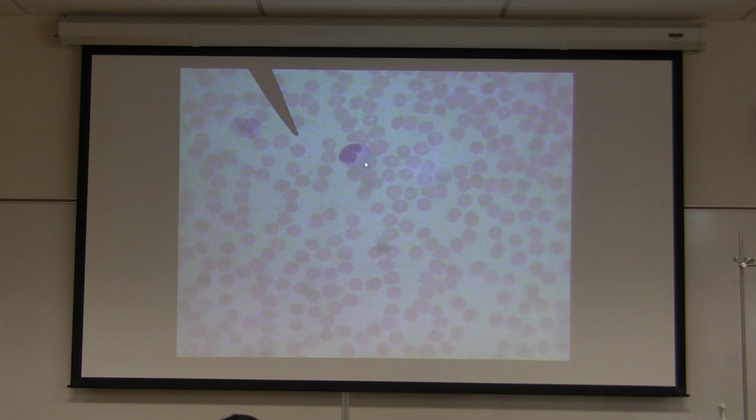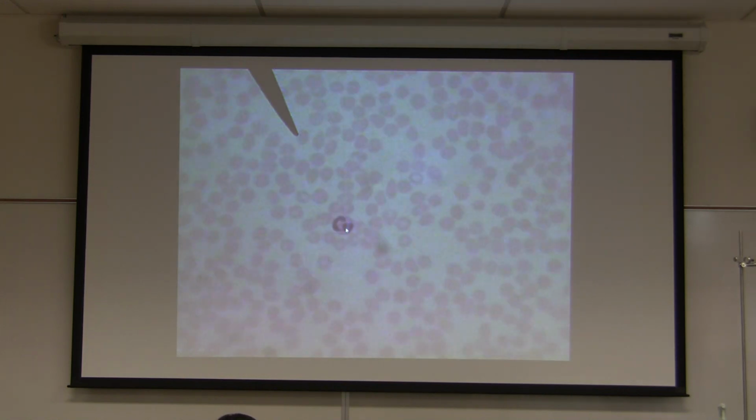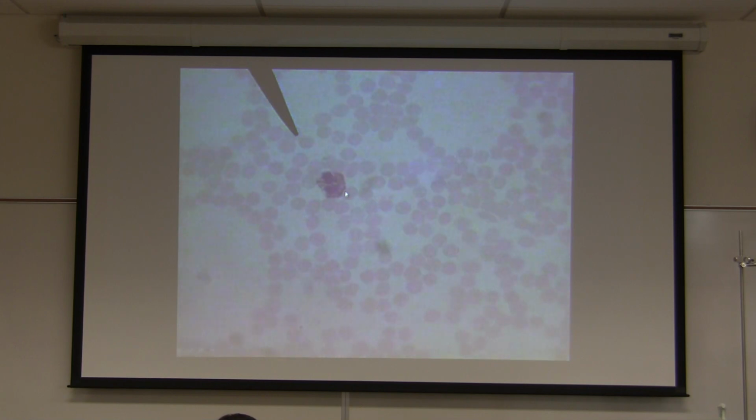What is the name of the cell? Monocyte, very good. C-shaped nucleus, and it is 3 times the size of a red blood cell. That's a monocyte. What is the name of the cell? Neutrophil. That's a neutrophil. What is the name of the cell? Eosinophil. Okay, what system? Immune system. What system?